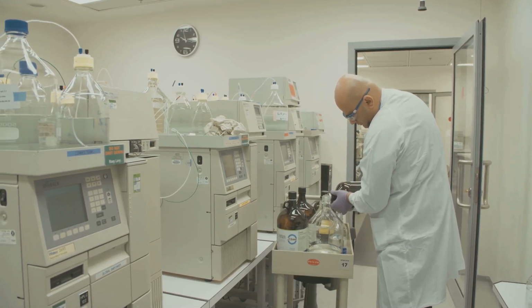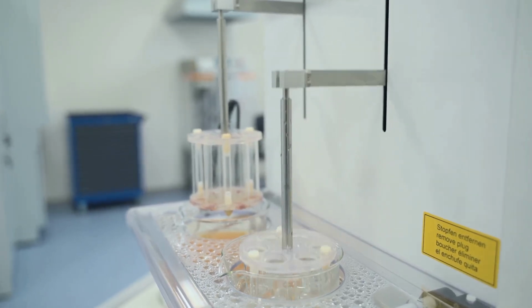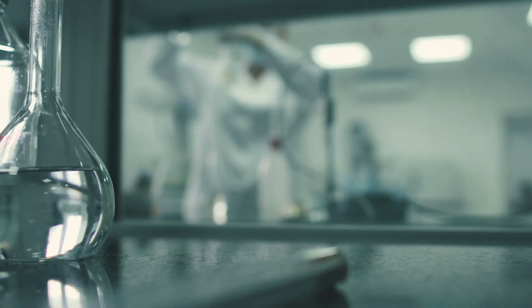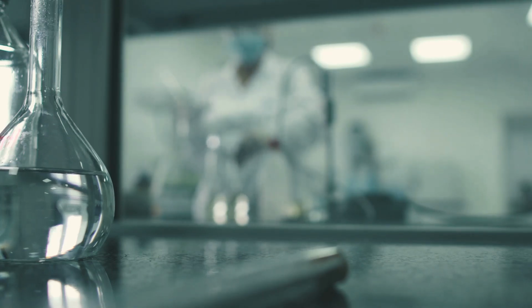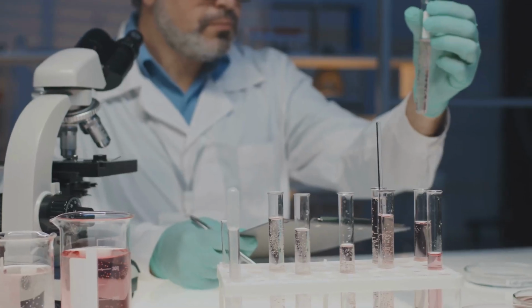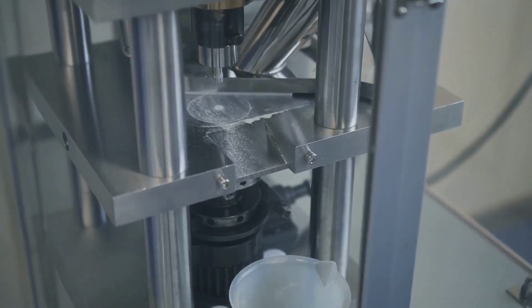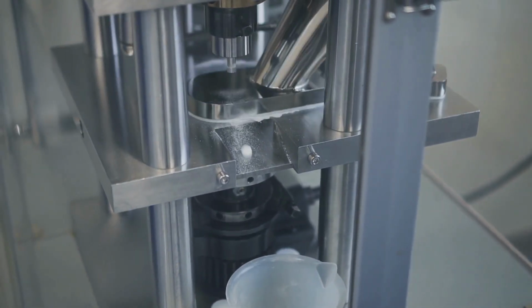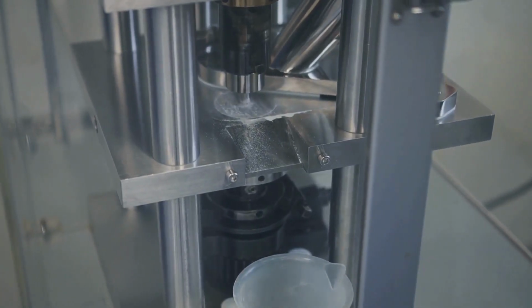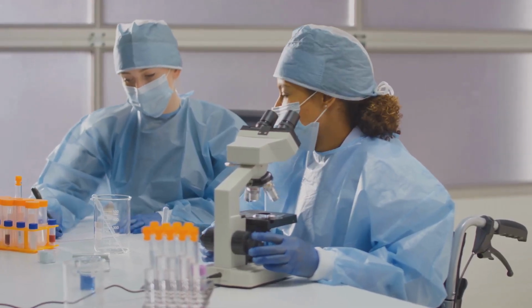Quality control begins with thorough chemical and physical analysis to ensure that pharmaceutical products meet required specifications. Chemical analysis. The objective is to determine the chemical composition and concentration of active ingredients and excipients in a drug product. Techniques include titrations, spectroscopy, and chromatography. Physical analysis. The objective here is to assess physical properties such as particle size, bulk density, and solubility. Techniques include methods like microscopy, sieve analysis, and rheology.